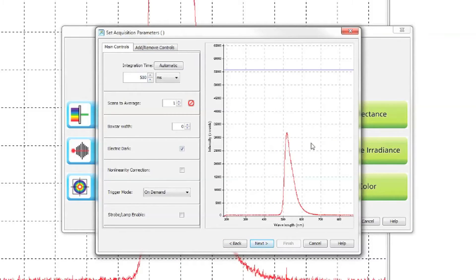However, fluorescence often gives low signal spectra, and for the purposes of this, a lower signal which still has a clear peak is suitable. You can also choose the number of scans to average for each acquisition and the boxcar averages applied. Both of these parameters adjust the smoothness of your spectrum.